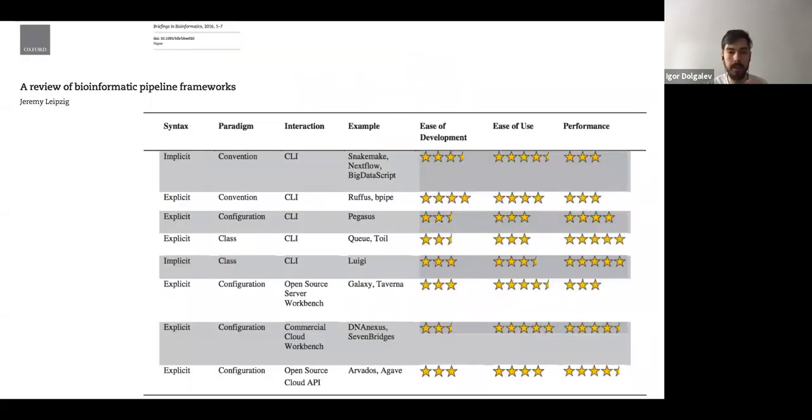And of course, there's been at least one review of different bioinformatic pipeline frameworks that looked at some of the more common ones that you may or may not have heard about before. Certainly the people on the bioinformatic side of things may have heard of a lot of them. I think the problem here is that the first column is the ease of development. A lot of these pipelines are really targeted for development. If you're a developer, that's one thing, but if you're a biologist, maybe that's not your top concern.